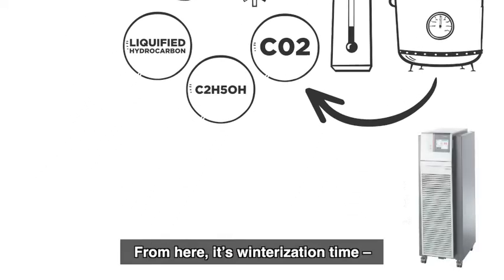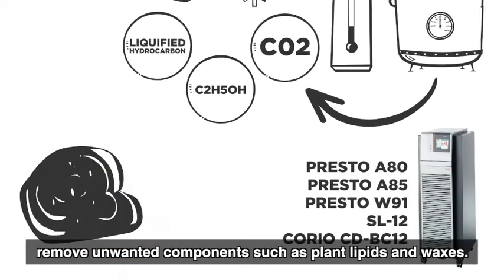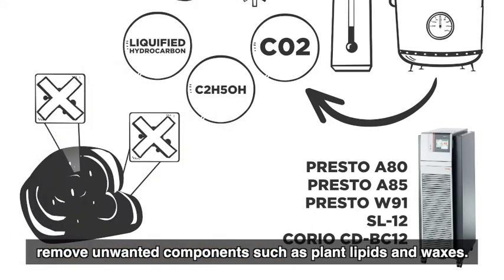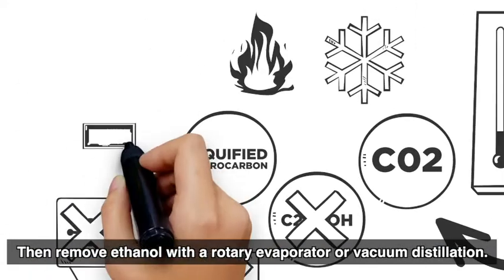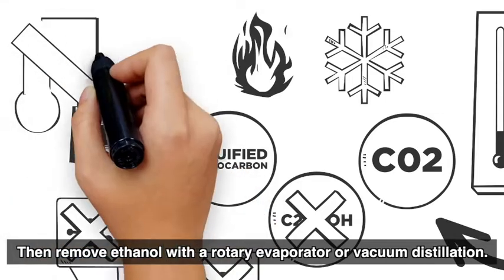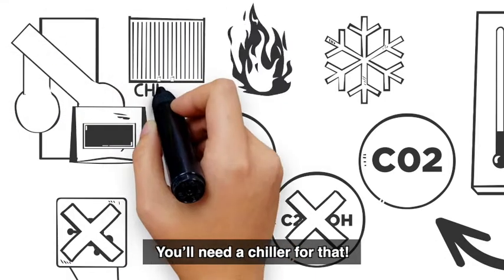From here, it's winterization time. Remove unwanted components such as plant lipids and waxes. Then remove ethanol with a rotary evaporator or vacuum distillation. You'll need a chiller for that.